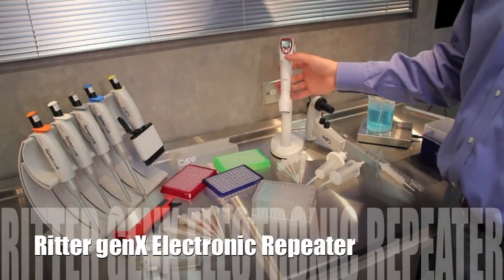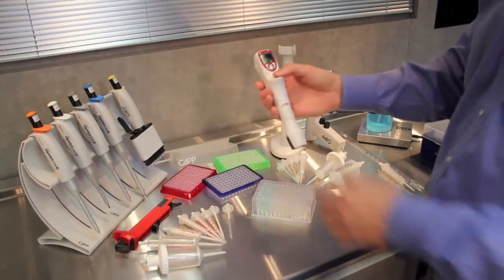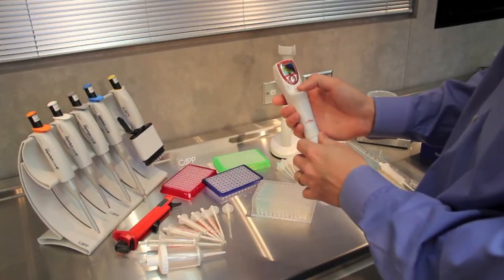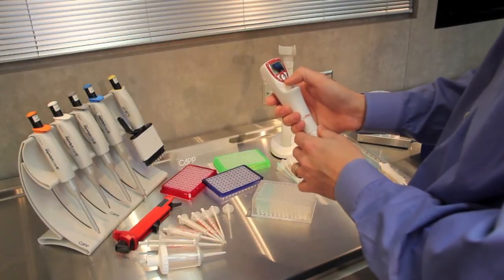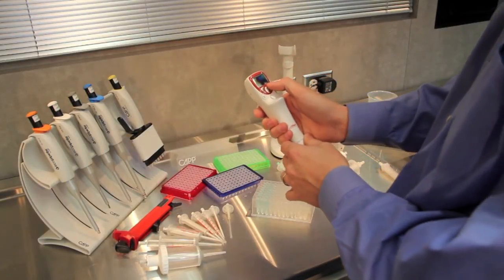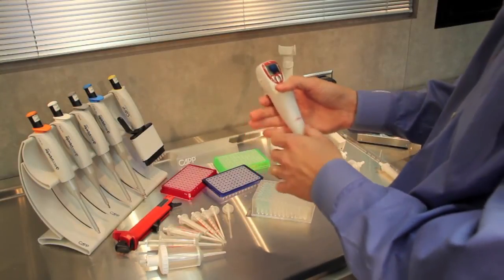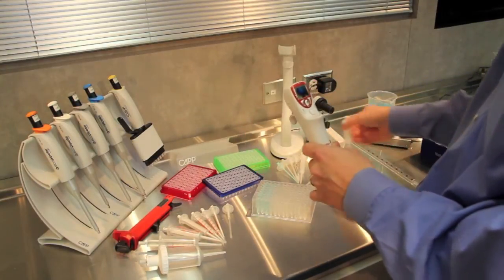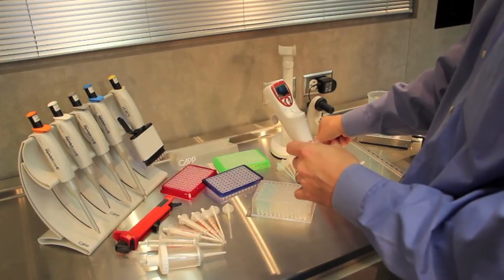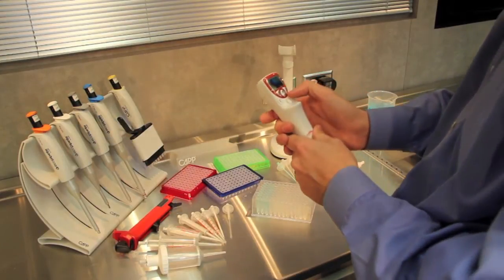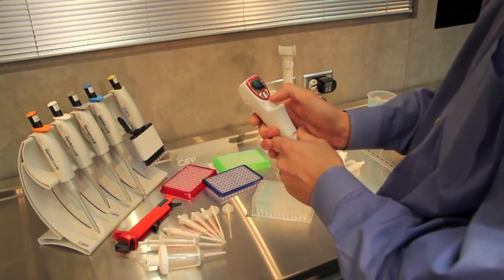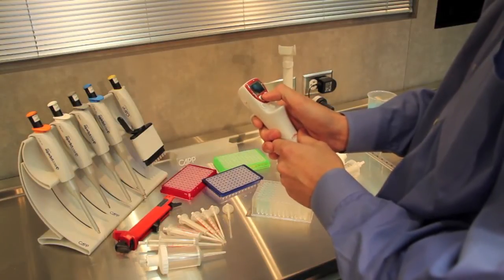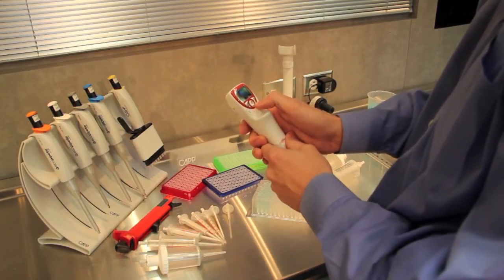The next option we have is the Ritter electronic repeater. With this one we have the flexibility of programming in nearly any volume that we want. It has a 100-step stepper motor in it, so you can take any one of the syringes and you can dispense one one-hundredth of whatever that volume is in each step. With this one we will select the 10ml syringe, we will select we want to do 1ml, and we're going to do it eight times.